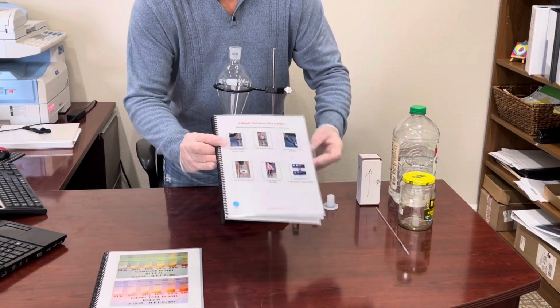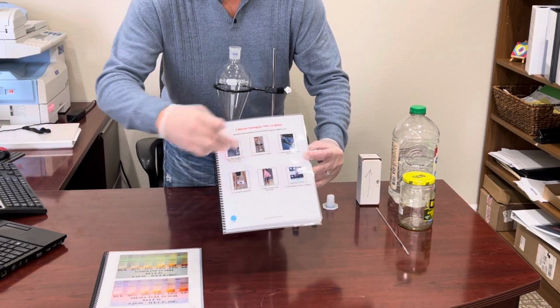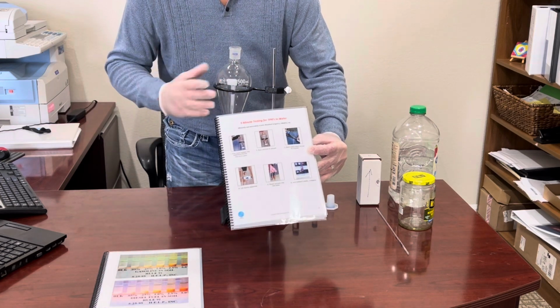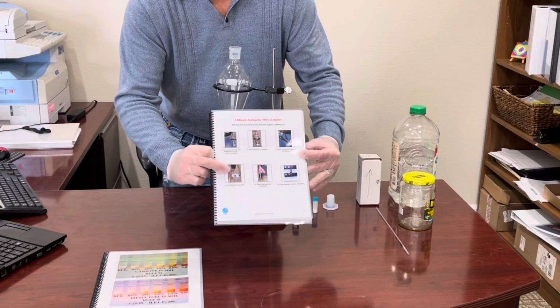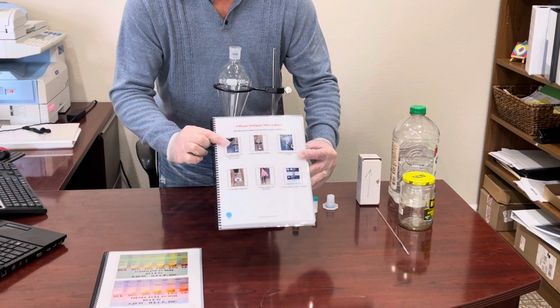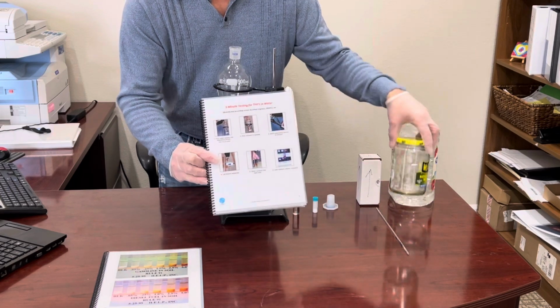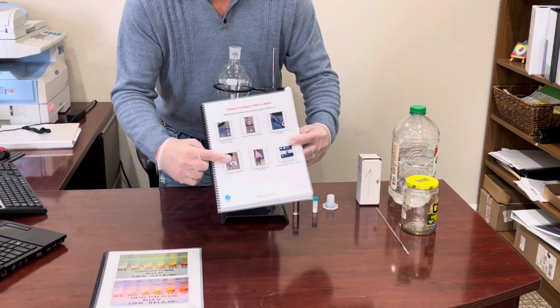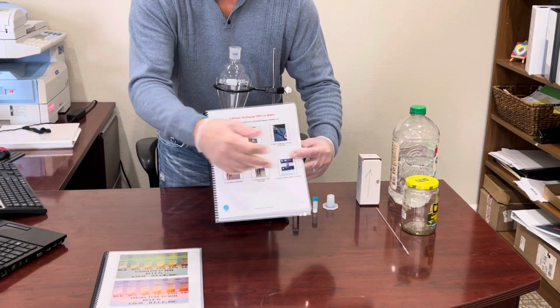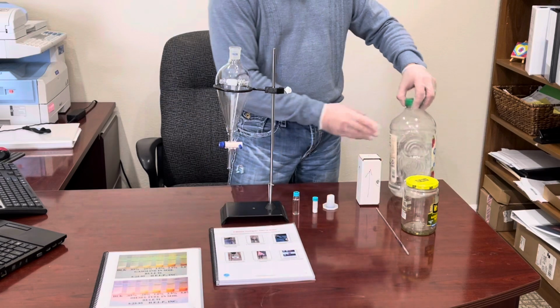As it shows, the steps in our water analysis process are: we put our water sample into the separatory funnel, then we add our extract solvent and swirl it around to do the extraction. Then normally we would put the separatory funnel back into the ring stand, our solvent separates to the bottom, and we would decant that off into the test tube. But instead, we're going to put our water sample in, add our extract solvent, and swirl it around. But before we release it, we're going to decant off the water sample because our solvent, in this case, is going to be floating on top of the water sample. Then the process is the same. We'll release the extract solvent into the test tube, add our white catalyst powder, cap and shake, and compare to the picture. So that being said, here we go.